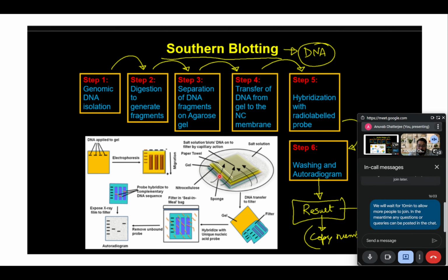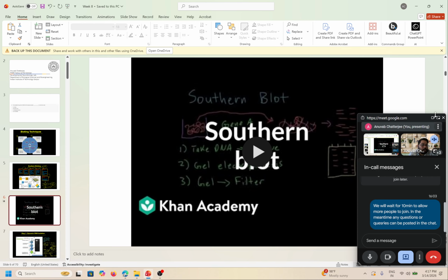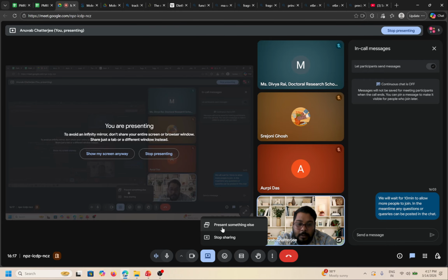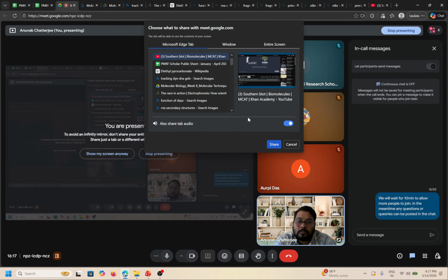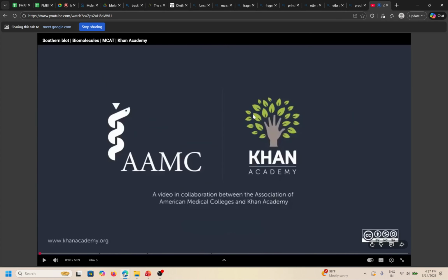So this is a big complicated process. We will take it bit by bit and understand more of it. So this is a video which describes in basic terms what exactly a southern blot is, and we'll take it from there. I will show you this video which is available on YouTube and the reference is given on the slides as well. Just let me know if you can hear the sound.